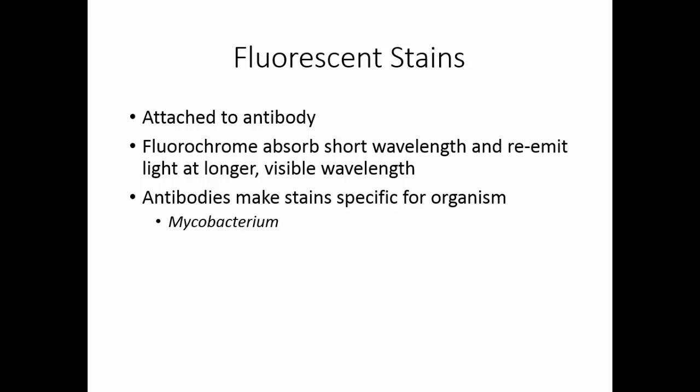For example, we have fluorescent stains for Mycobacterium, and we have fluorescent stains for Legionella. Not only does it aid in the visualization, but we now know that just from staining that specimen, the suspect organism is in the specimen.